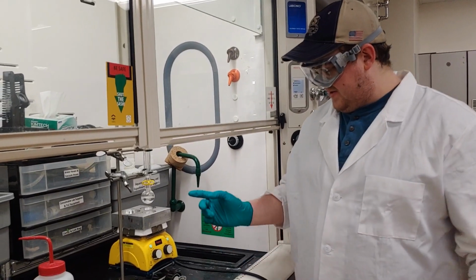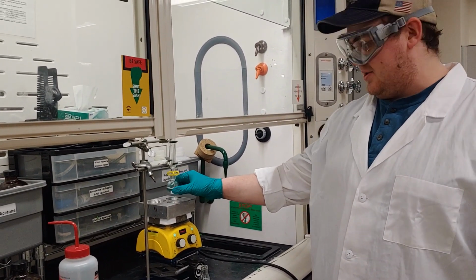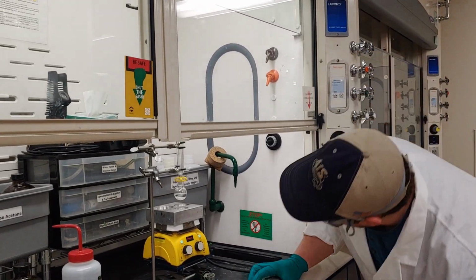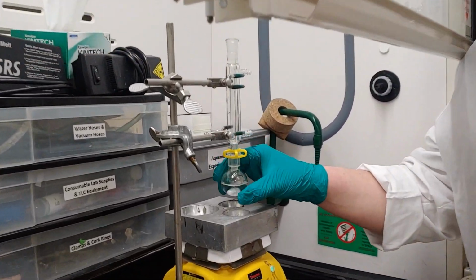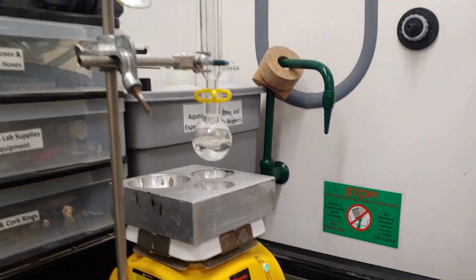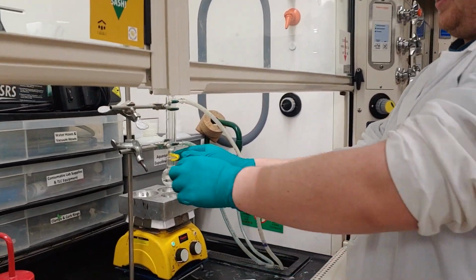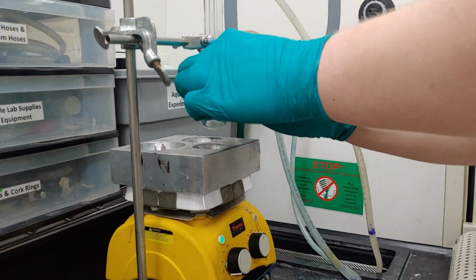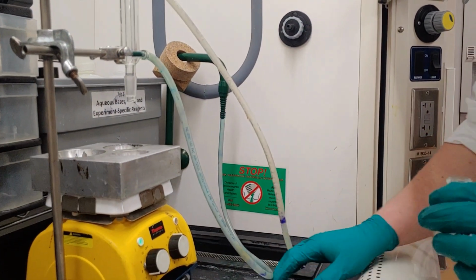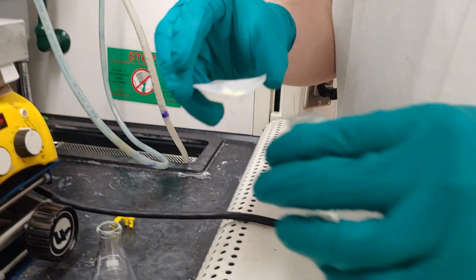Alright, so what I have here is a round bottom flask with 1,3-diphenylacetone and ethanol, and I'm waiting for all of the 1,3-diphenylacetone to dissolve. Alright, so now that the diphenylacetone has completely dissolved, I will now add benzil and sodium hydroxide. I have it weighed out in this weigh boat.